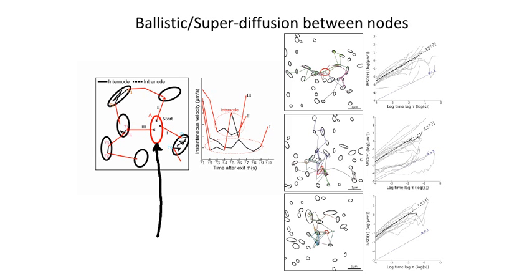And associated to this, what was quite interesting is that if we look in here, we saw that the moment of escape was associated with a very high velocity.